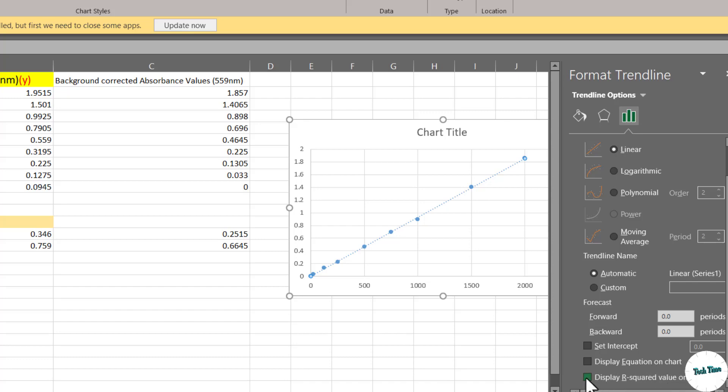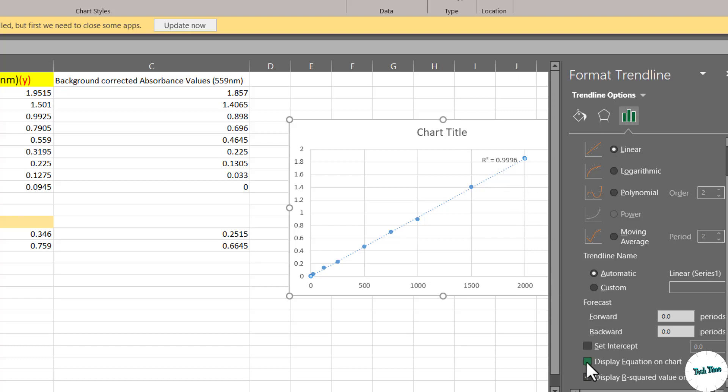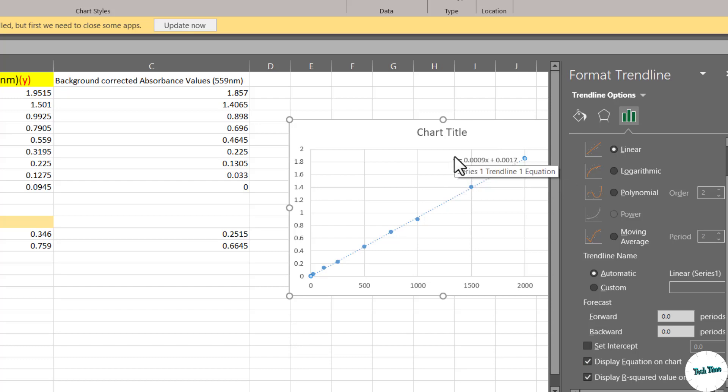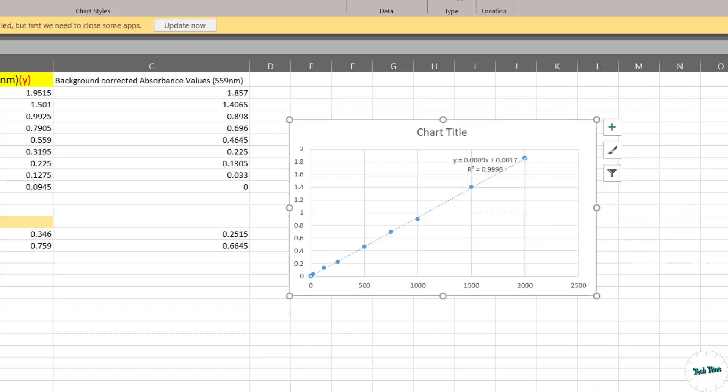Let me check this display R squared value on the chart and right over here you can see we have R squared value equal to 0.9996. Let me check this display equation on chart as well and there we go. You can see we have our equation displayed on our chart as well. Let me close it.